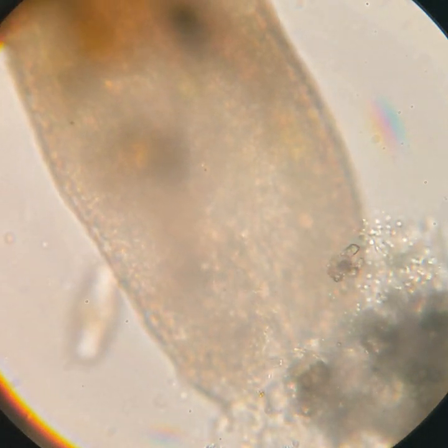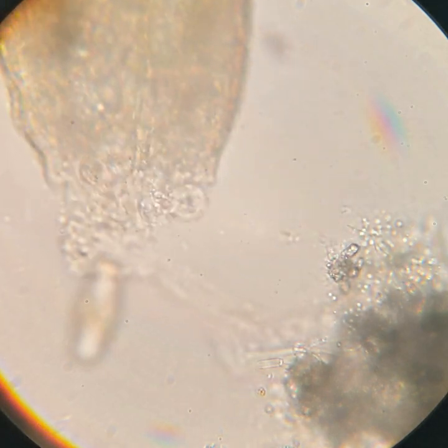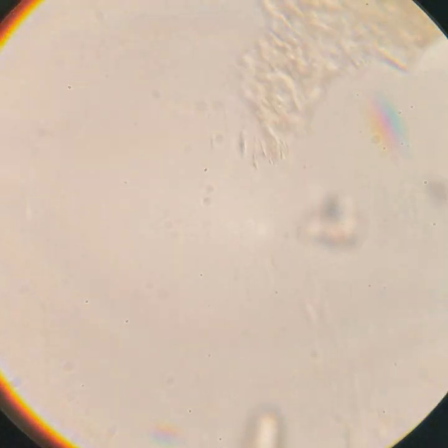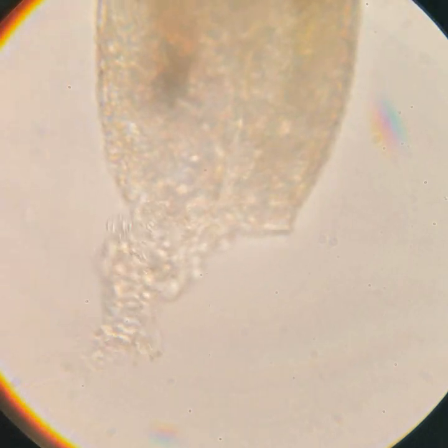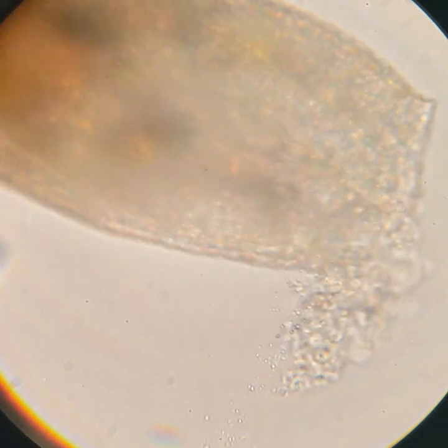Something which is under this piece of detritus has gotten a hold of him, and right here you can see that he rips himself free. Now as I hurry to adjust my focus and try to keep up with the little guy, I'm really in his corner — I really thought that his membrane would repair itself and he'd be okay.